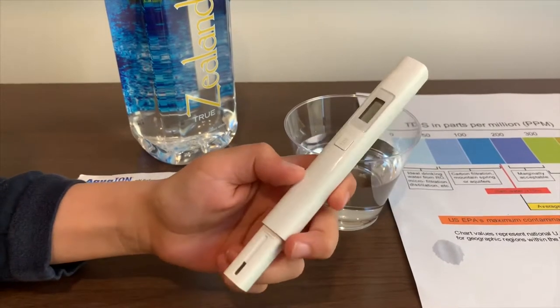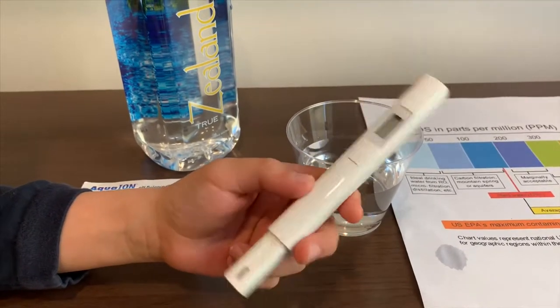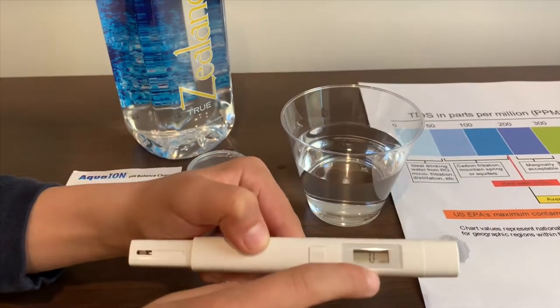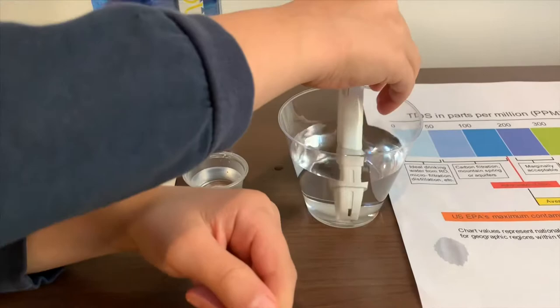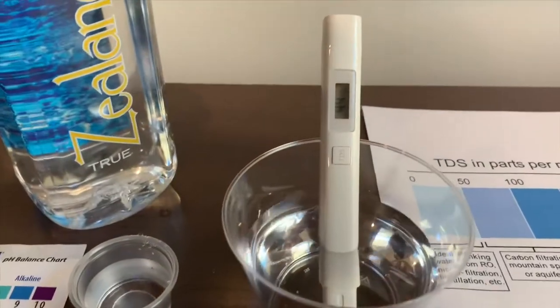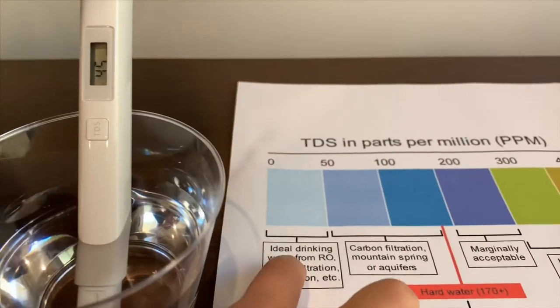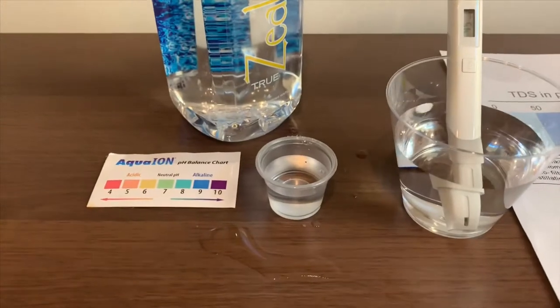If you want to buy this TDS tester, check the link down below. Turn on the TDS tester, make sure it says 0 and put it in. It is 45. That is ideal drinking water.